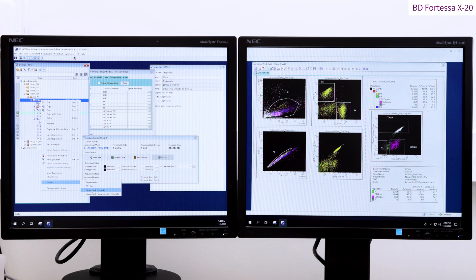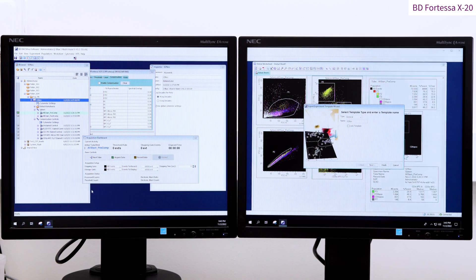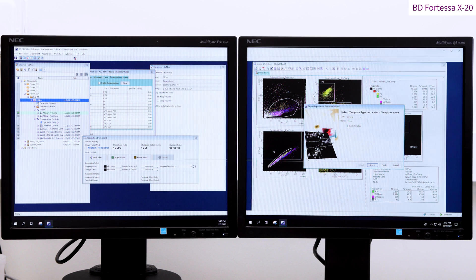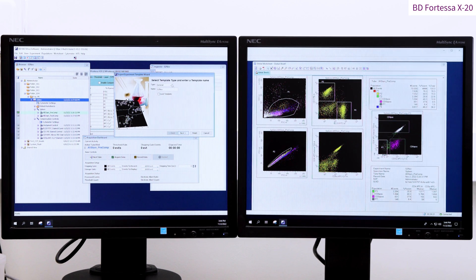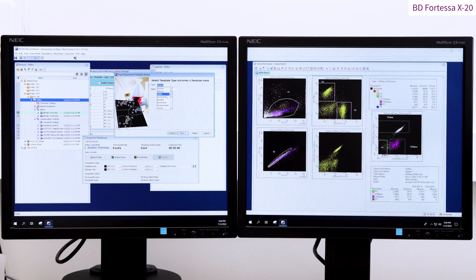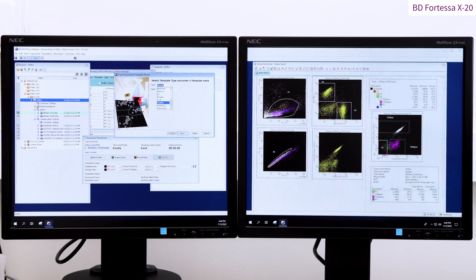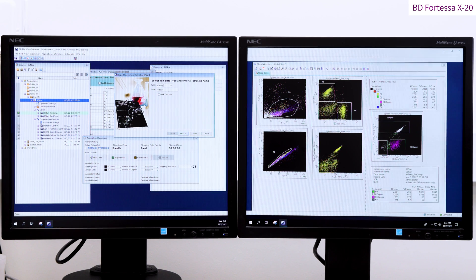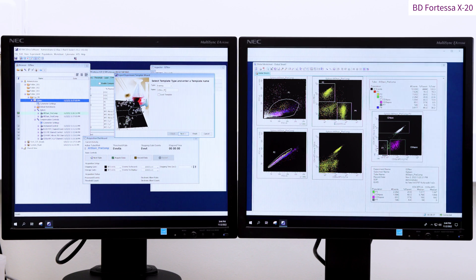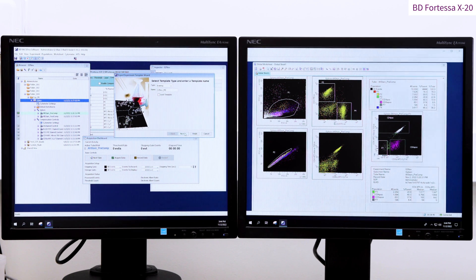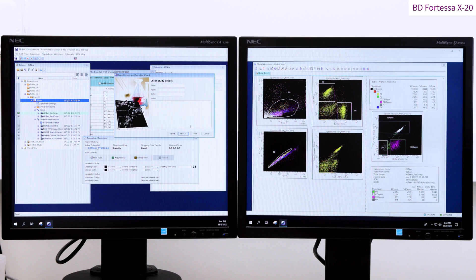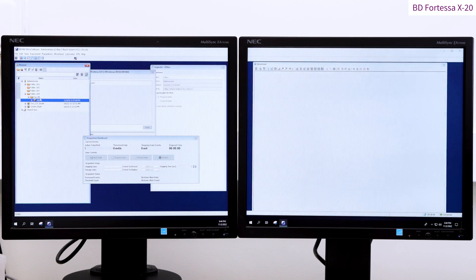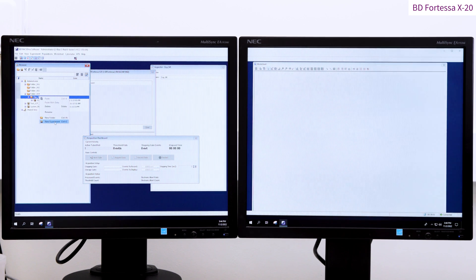You can save your experiment as an experiment template and this will record your experiment design including voltages, gating strategy and the sample names but without the data. The experiment template files are small in size and allow you to free a significant amount of space in the diva software. Place the experiment template in the appropriate type folder via the export experiment sample wizard.